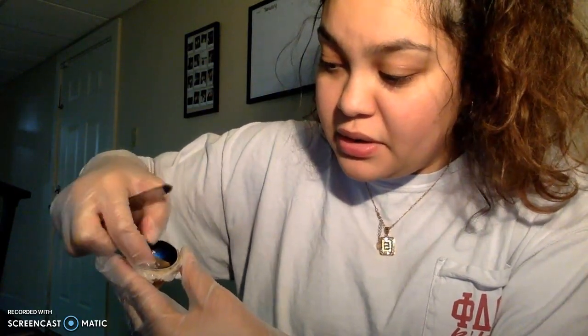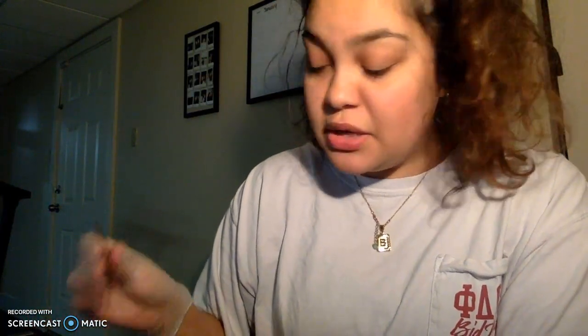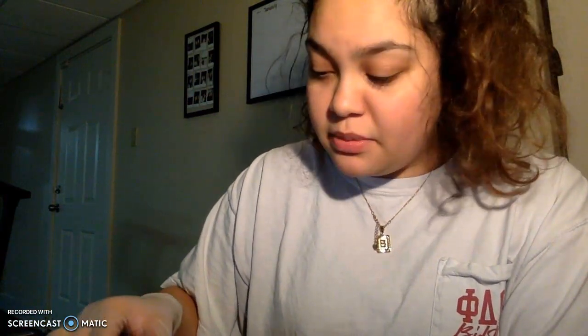This right here. And then when you flip it over on the retina, you can see it, is the vitreous humor. The vitreous humor is found in the posterior cavity, while the aqueous humor is found in the anterior cavity. And when I cut into the cornea from the lab, you could see the aqueous humor, it came out. I can't show you it because it's just liquid, but I can put some on my gloves. You just saw it drop onto my other hand. That was the retina, and then the vitreous and aqueous humor.